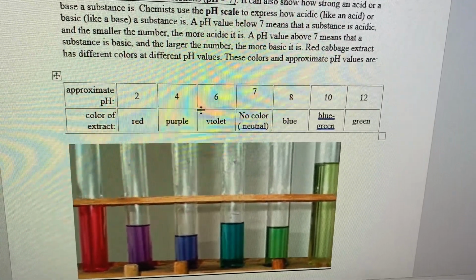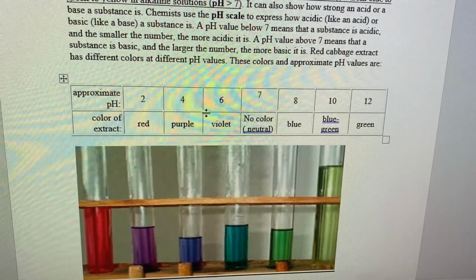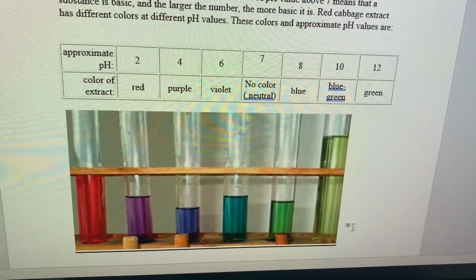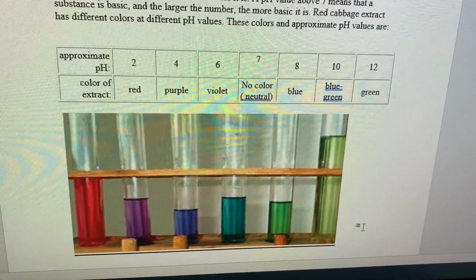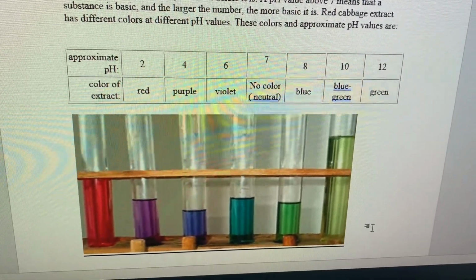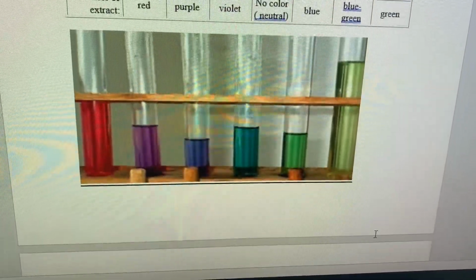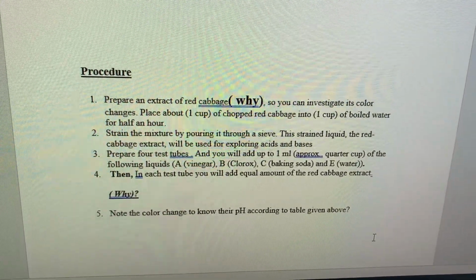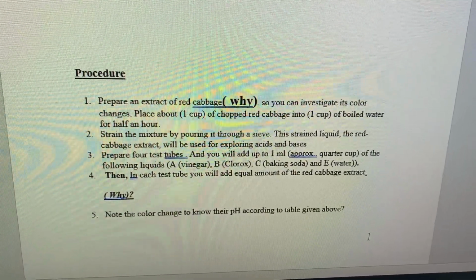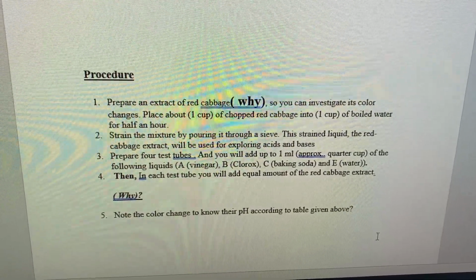This is if we don't have the machines that measure the pH scale, and this is the coloration over here. But I have a much simpler indicator. You know what it is? Other than the pH paper, if we don't have a pH paper, it's this experiment, which I will urge you to do back at home. I will perform it, but I need you to do it back at home.